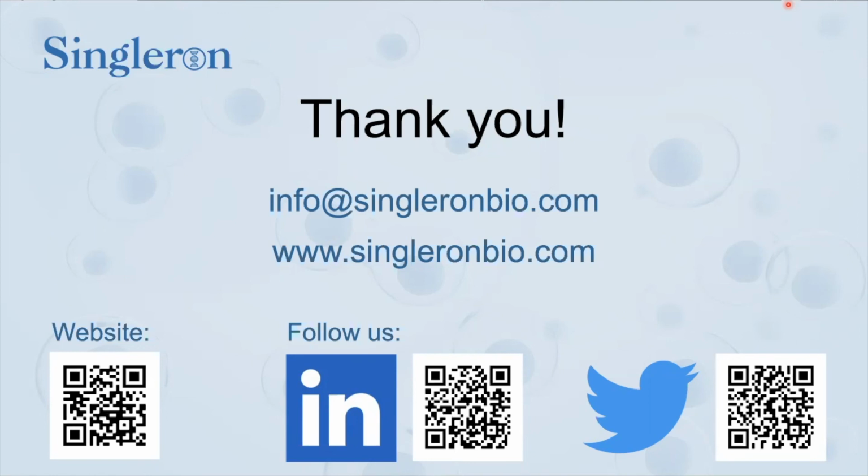How to make sure that one cell or bead is present in each well? As I described in my presentation, our technology is based on a microwell system that contains hundreds of thousands of wells. The number of cells that we load is very low compared to the number of wells that we have. That assures that it follows a Poisson distribution.